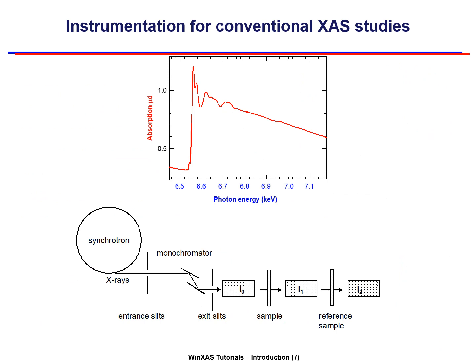Finally, I will not talk about instrumentation for X-ray absorption measurements. This includes sample preparation, appropriate thickness and absorption, sample holders, and the design of the various spectrometers available to perform XAS measurements under a variety of conditions or time scales. Again, I assume that you have a decent set of experimental spectra that you want to analyze in a convenient and time-efficient, but also transparent manner. And this is exactly what I want to talk about in the following tutorials.